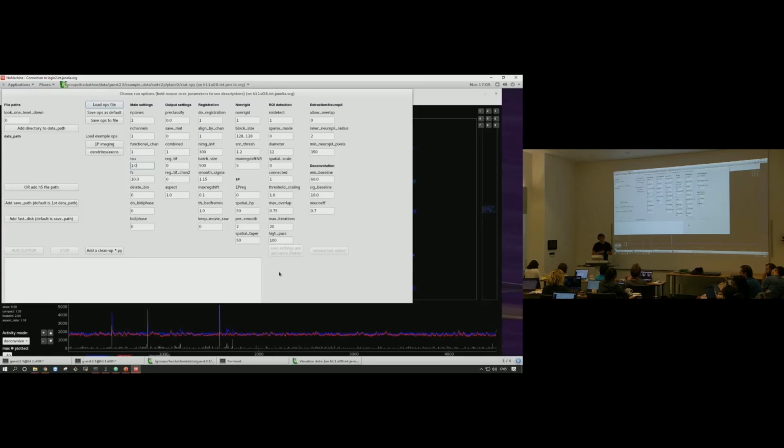So we actually bin at exactly 1 tau of the data. If our data is recorded at a sampling rate fs of 10 hertz and tau is 1, then the movie that we actually do cell detection on is binned at 10 frames.